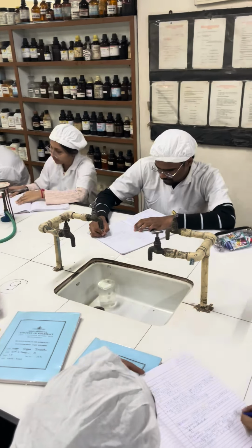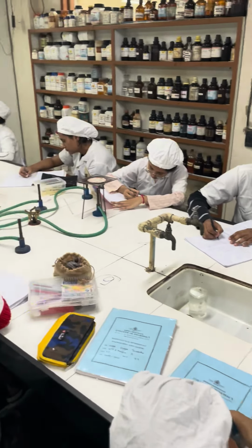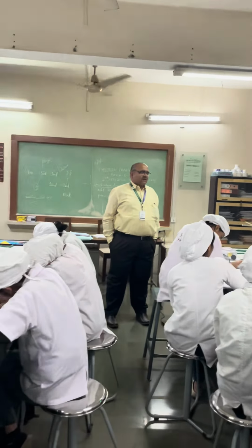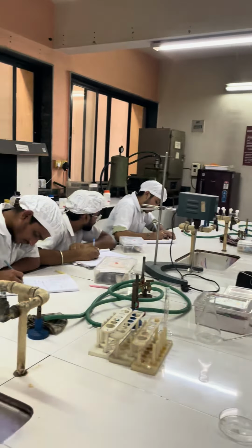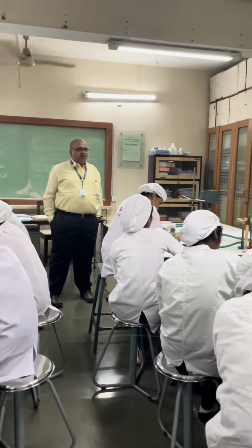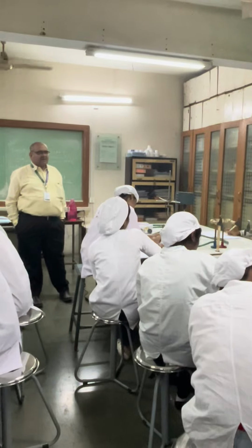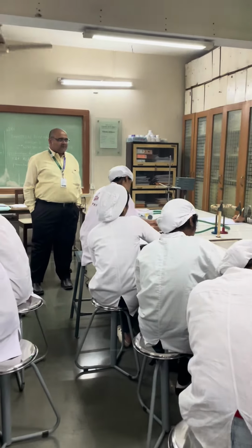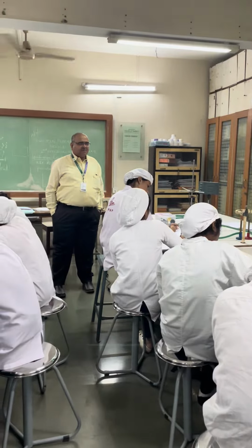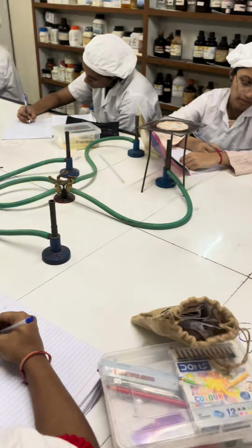Procedure for this test, MPN: sterile lactose fermentation broth test tubes, double strength and single strength, are arranged in rows, 3 rows. Double strength lactose fermentation broth, 3 test tubes in one row. Single strength lactose fermentation broth, 3 test tubes in the second row. Single strength lactose fermentation broth, 3 test tubes in the third row.